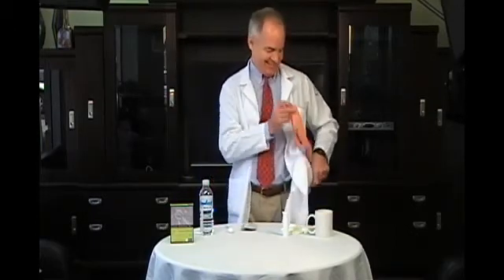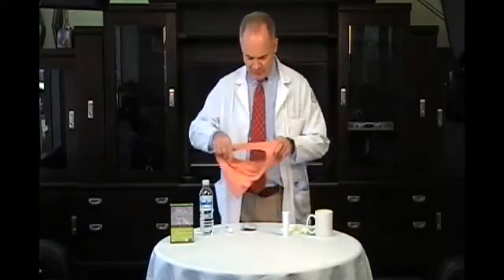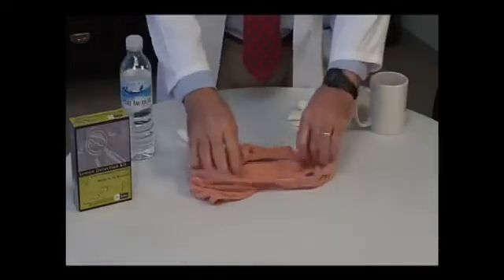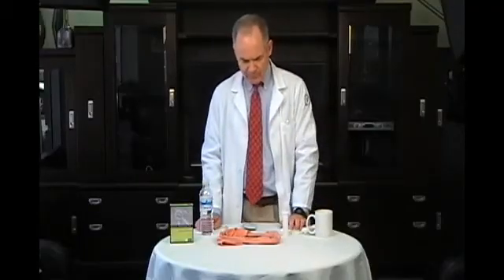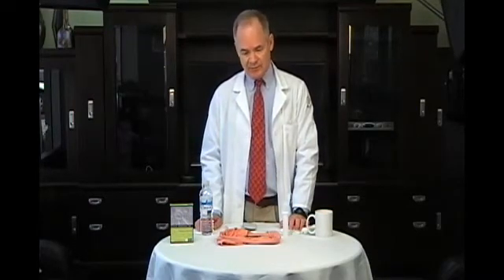on it. Here we have the garment right here. What you first do is you pull out the garment and you look at it and identify the stain so we can look at the stain directly. Now, semen has over 900 identified proteins. This test kit tests for 2 of them, acid phosphatase and prostate specific antigen.